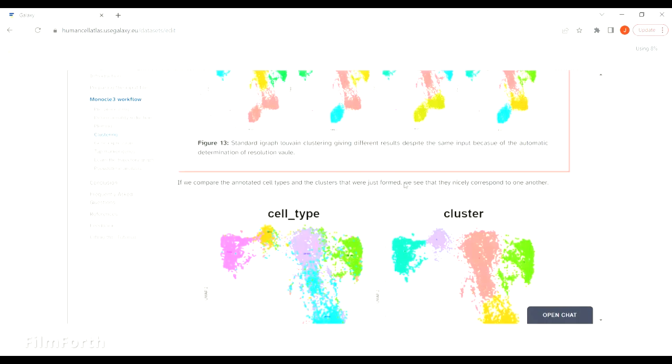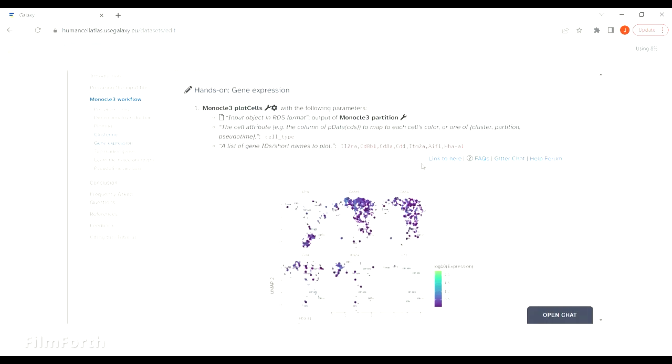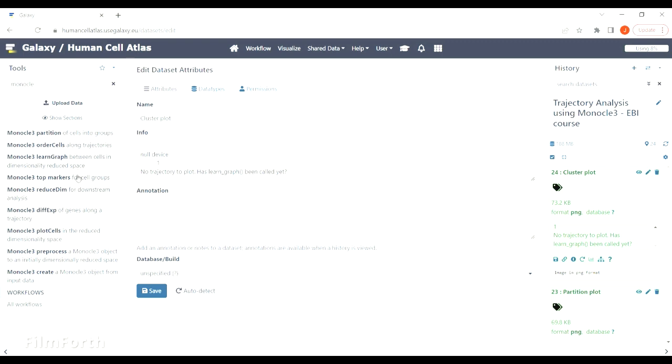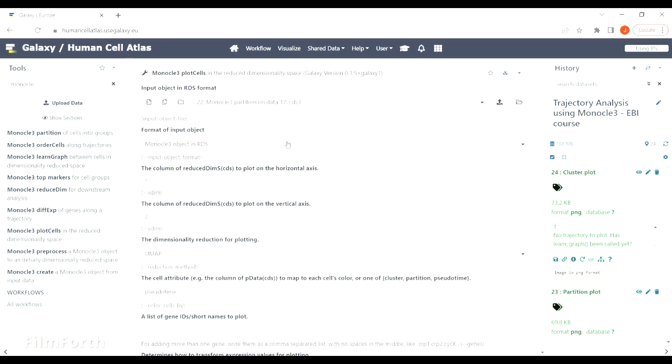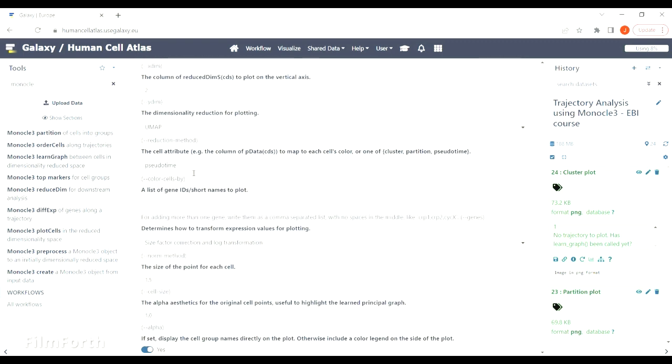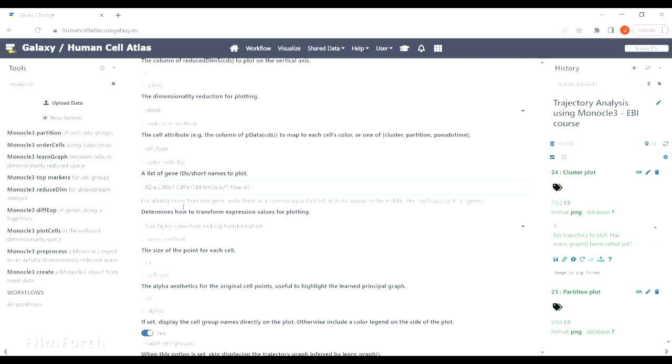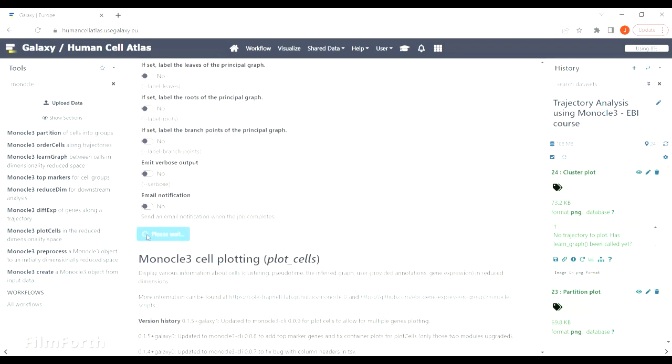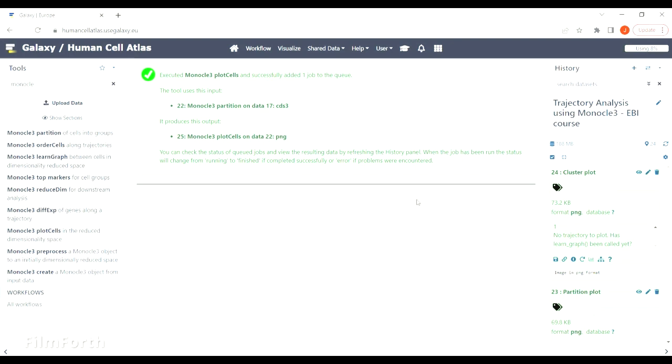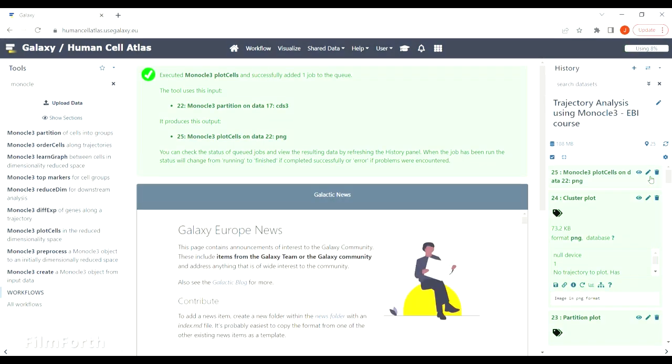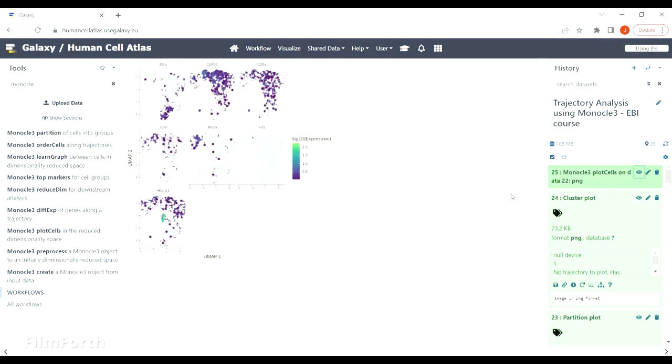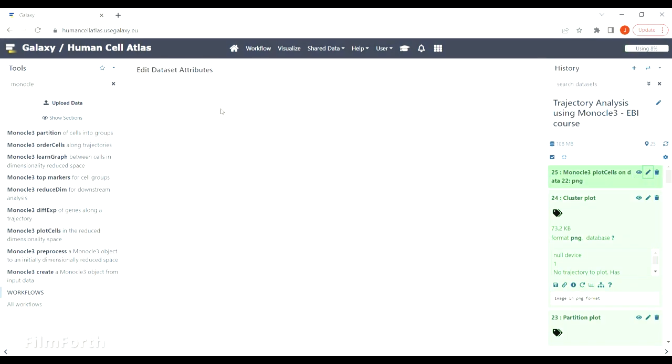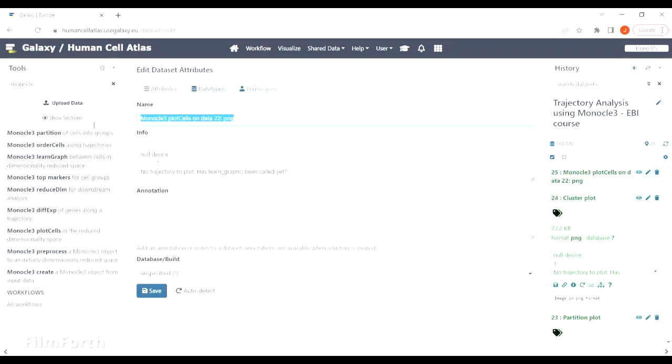Those are the genes that expression we are interested in the most, so let's just copy and paste those genes and plot them. This is how they look. There are clearly some correlations that you can read about in the main tutorial text.